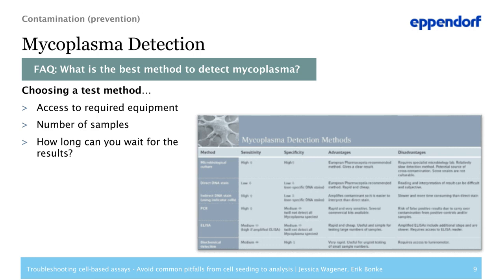Our first FAQ: What is the best method to detect mycoplasma? You see an overview of the different methods, and as you can see, all of them have advantages and disadvantages. When choosing a method for your lab, several aspects should be considered: Do you have access to the desired equipment? How many samples do you need to test at once? And how long can you wait for getting the results?